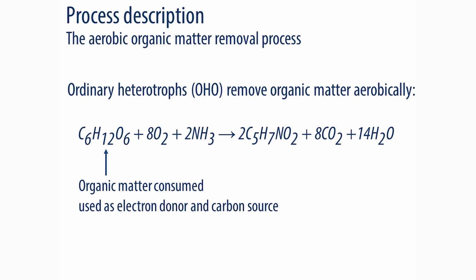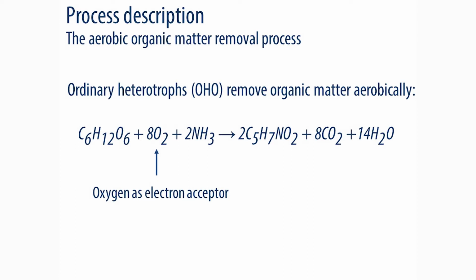Usually, organic matter is measured as chemical oxygen demand, COD.